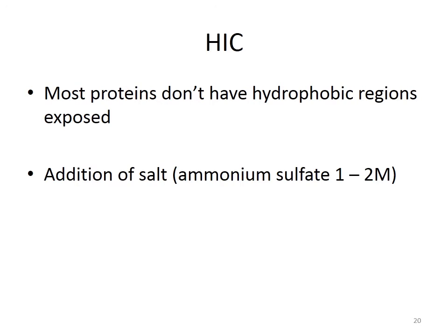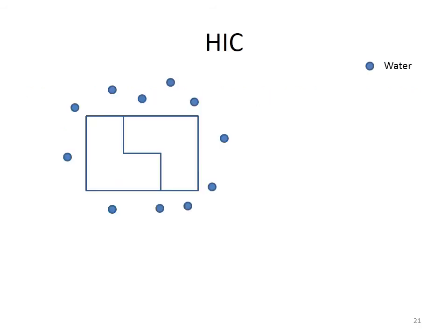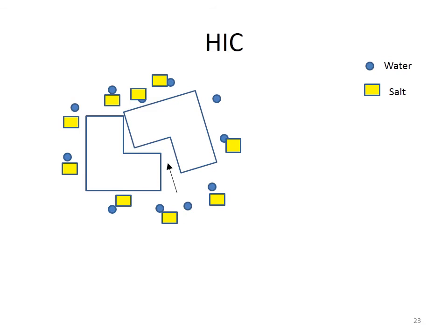This phenomenon operates in the following manner. As the salt concentration decreases, the protein will fold back into its original structure, and the hydrophobic regions will again be shielded. So when we want the proteins to bind to the stationary phase, we increase the salt concentration in the protein solution. The protein structure opens up.